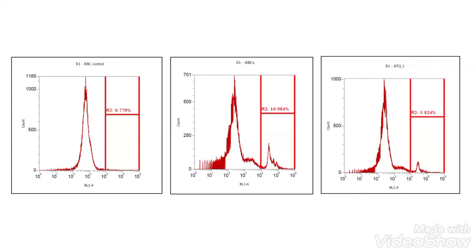It is very simple, ma'am. If you really want to check whether your drug is entering inside the target cell or not, you can label your drug with FITC or with any fluorescent dye, and you put it on cells. And if it is entering inside the cell, then your cells will gradually become positive for that fluorescent dye. And after adding the drug, you can select different time points like 15 minutes, 30 minutes, 1 hour, 2 hour, 4 hour, 8 hours.